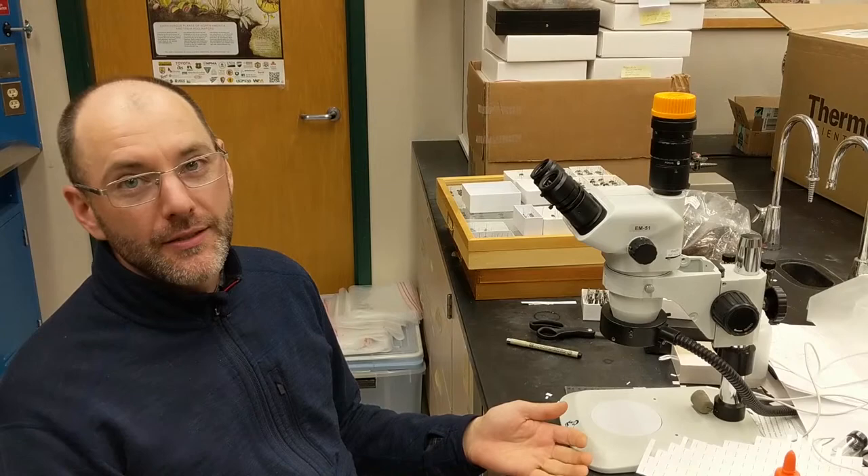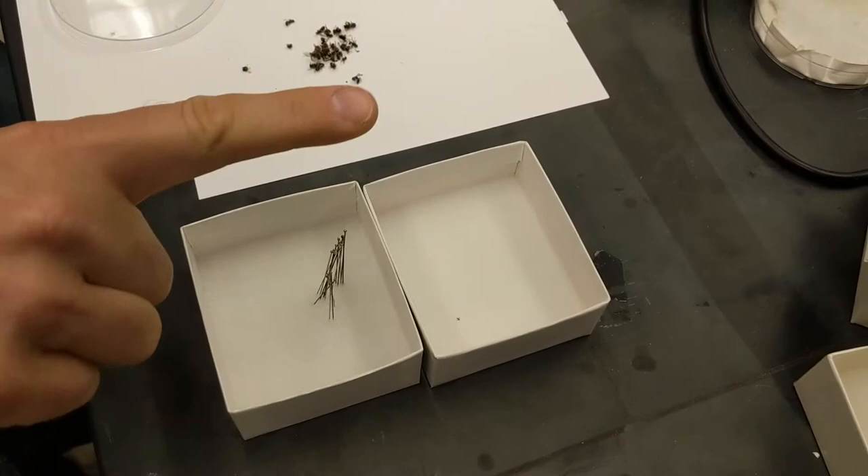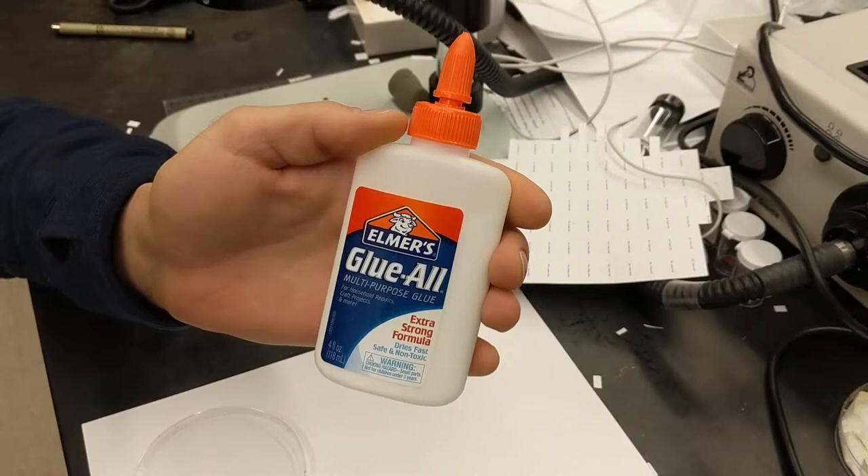Good afternoon folks. I'm going to give you a tutorial on how to glue bees to pins. You'll want your little tiny bees, you want some trays or your box to pin into, and you'll need some pins and you'll need some glue.